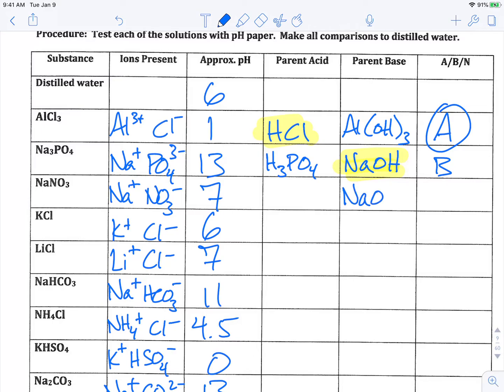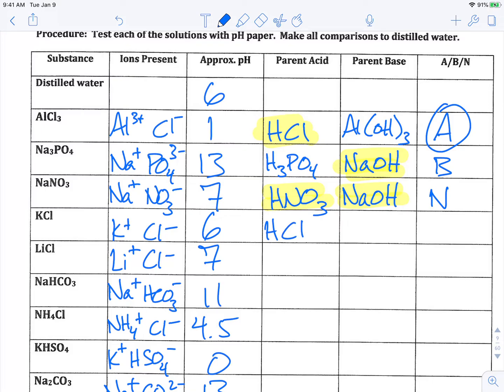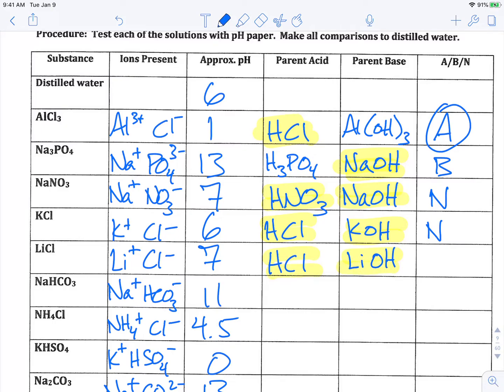Na⁺ ions always yield NaOH as the parent base. For NaNO₃, the parent acid is HNO₃. Both nitric acid and sodium hydroxide are strong, so we'd expect this to be neutral — and at pH 7, it's very close to our distilled water baseline of 6. For KCl, HCl is the acid and KOH is the base; both are strong, so it's neutral. For LiCl, lithium hydroxide is the base and HCl is the parent acid; again both are strong, so we'd expect neutral — and we see a neutral pH.